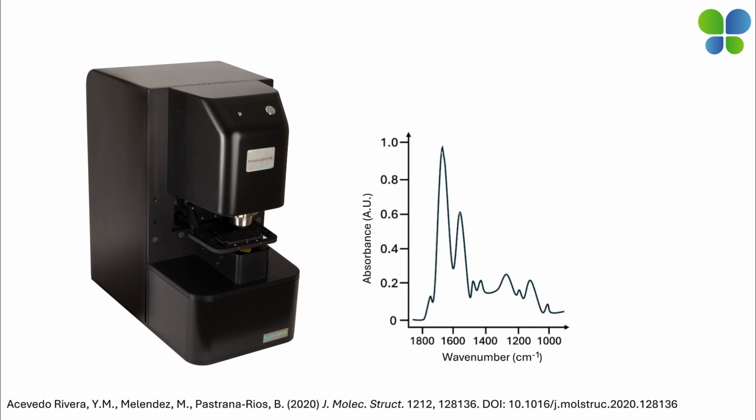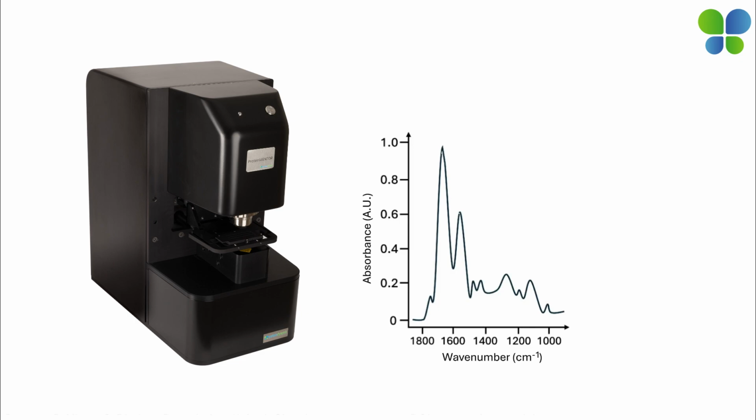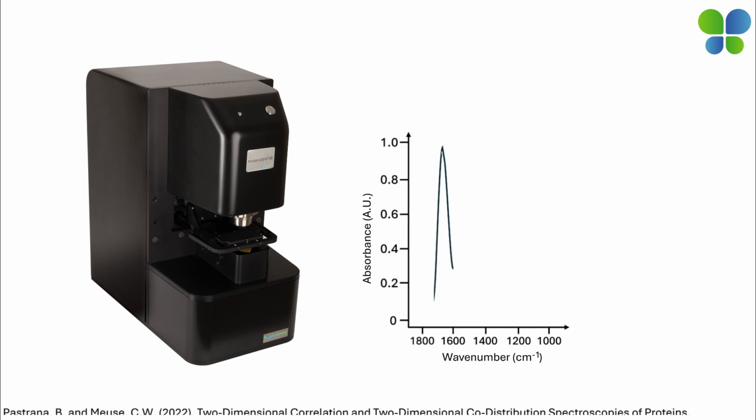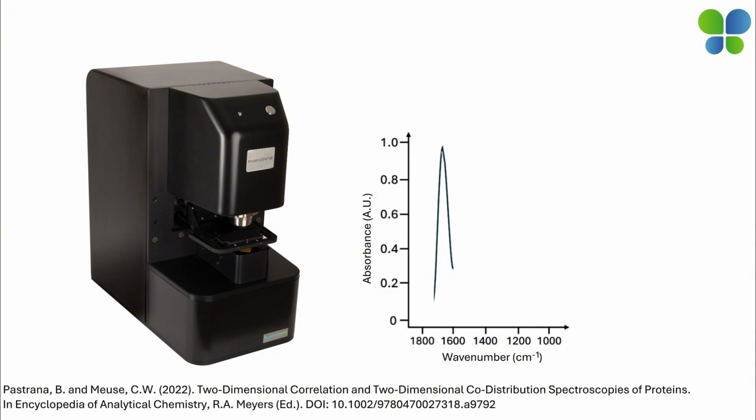A ratio of the transmitted quantum cascade laser's light source, with and without sample, is captured by a focal plane array that is 480 by 480 pixels, and yields the absorbance spectrum for each pixel within the hyperspectral image or spectral data cube. While current technologies limit their understanding by focusing solely on the region of the amide 1 band, ProteinMentor expands its view beyond the amide 1 spectral region.